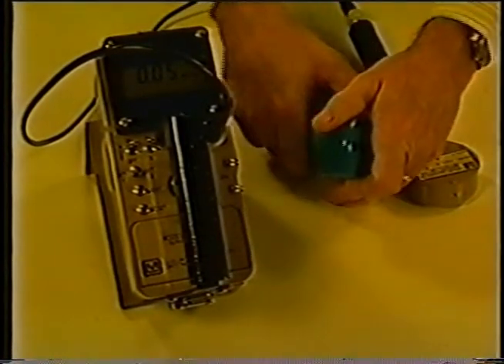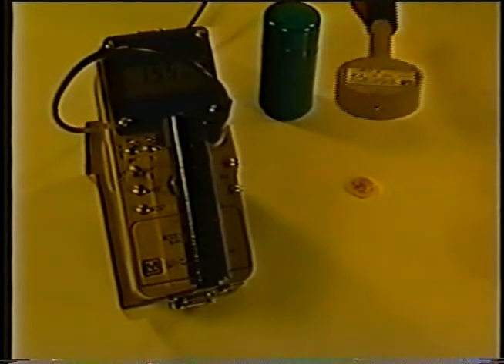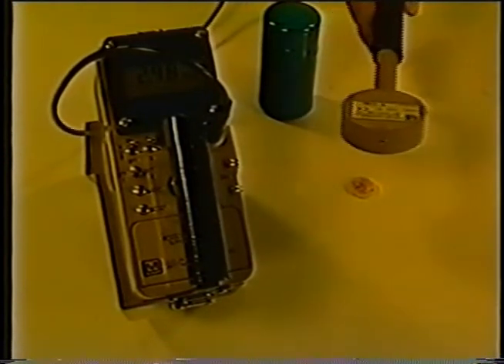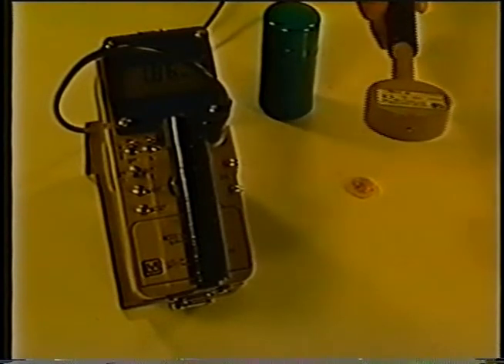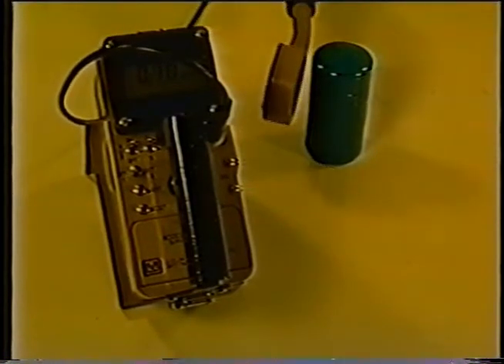Gamma radiation does not contain any mass — instead it is an energy wave that can travel thousands of feet in air. A gamma radiation source is now being surveyed with the Model 44-9 detector. The Model 44-9 can easily detect gamma radiation from a few inches to several feet away from the source, depending on the activity. As the detector is moved closer to the source, the count rate and audio clicks will increase dramatically. Gamma radiation can penetrate deeply into the human body and cause widespread internal damage to body organs — therefore, gamma radiation is considered both an internal and external hazard. Very dense materials such as lead, concrete, and depleted uranium are the best at shielding gamma radiation. A sheet of aluminum will partly attenuate the gamma radiation but will not block it completely, whereas placing the source back in the lead-filled container completely attenuates the gamma radiation and only background radiation is counted.